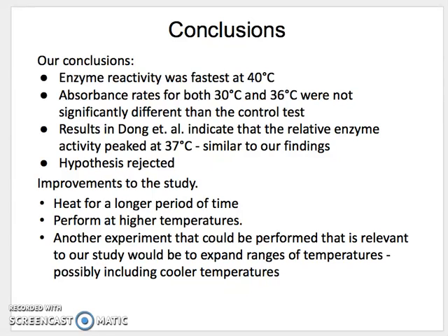Our experiment could be improved by heating the solutions for a longer period of time. The Dong et al. study heated their solution for 35 hours before measuring the absorbance, while we only heated ours for 15 minutes. If the solution were heated for a longer period of time, then it would be less likely to experience heat loss when transferring the cuvette to the spectrophotometer. The temperatures would be more reliable and therefore give more accurate results.